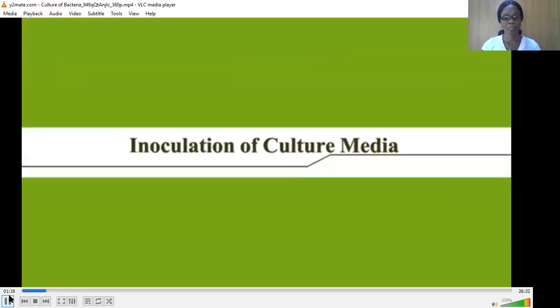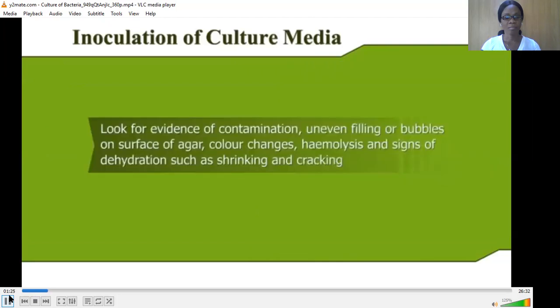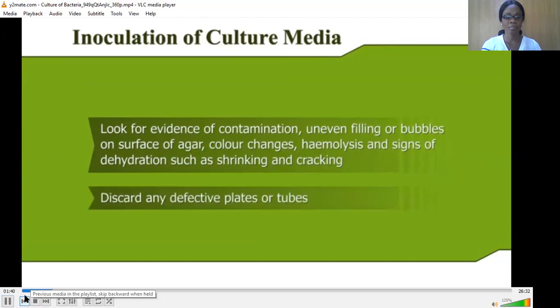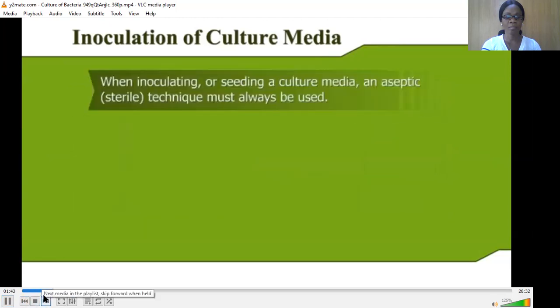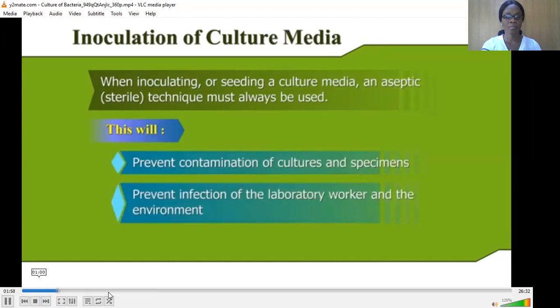Inoculation of culture media. Examine prepared media immediately before inoculation. Look for evidence of contamination, uneven filling or bubbles on surface of agar, color changes, hemolysis, and signs of dehydration such as shrinking and cracking. Discard any defective plates or tubes. When inoculating or seeding a culture media, an aseptic technique must always be used. This will prevent contamination of cultures and specimens, and prevent infection of the laboratory worker and the environment.